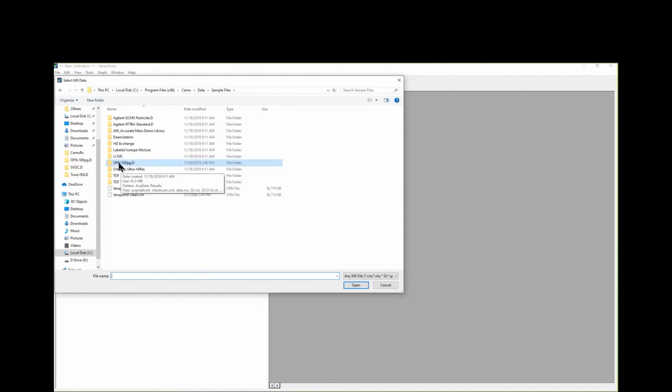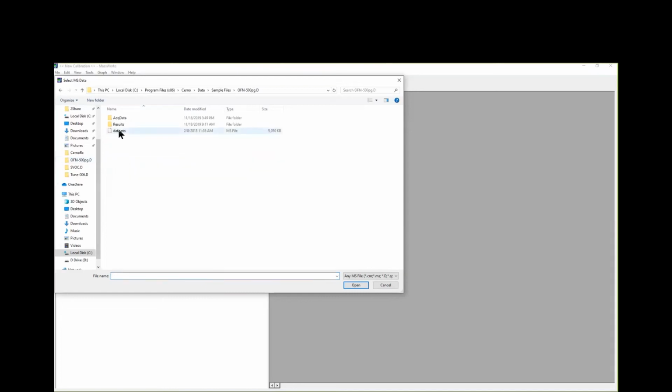That's kind of special to Agilent. So something a little bit different, if you want to open up the actual mass spec run data in MassWorks, you go to the .d folder, you double click on it, and you'll see a file that's created called .ms. That's actually the ChemStation format binary file. You just need to point the software to that and say open, and that will open the run data from the run. So that's a little bit different from what you're used to.